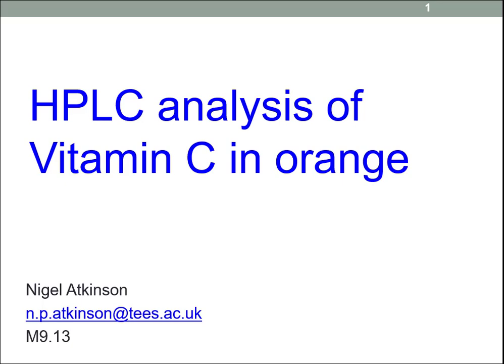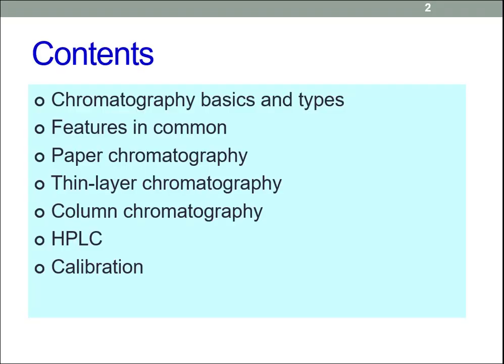Okay, quick review of the forthcoming lab on vitamin C analysis by HPLC. What we're going to be covering, you'll have covered some of this in previous modules such as biochemistry, where you've done calibration lines.